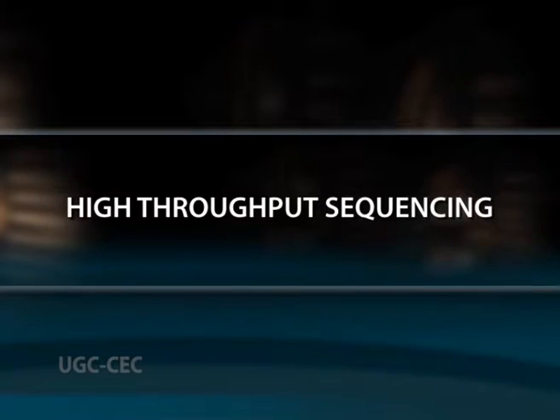High throughput sequencing. The need for low cost sequencing has led to the development of high throughput sequencing technologies that parallelize the sequencing process, producing thousands or millions of sequences at the same time. High throughput sequencing technologies aim to lower the cost of DNA sequencing beyond what is possible with standard methods. Now let us study the different high throughput methods.